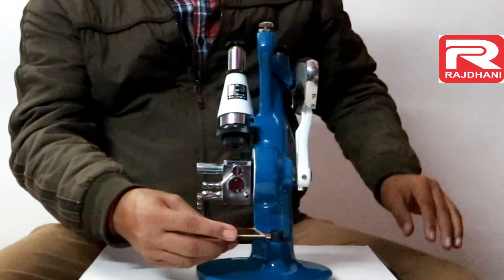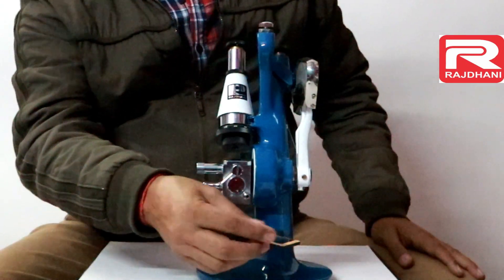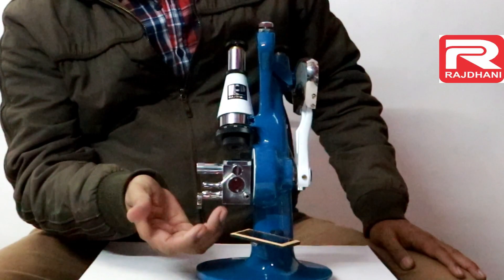This is the reflector. It is used to collect the ambient light and direct it inside the prism box.